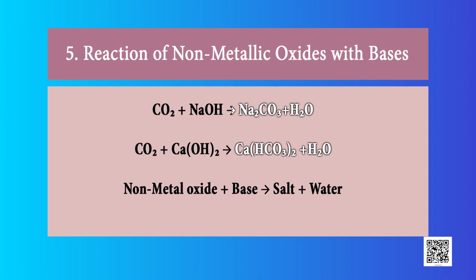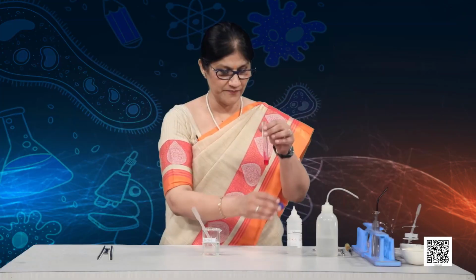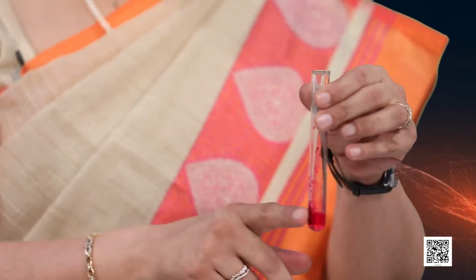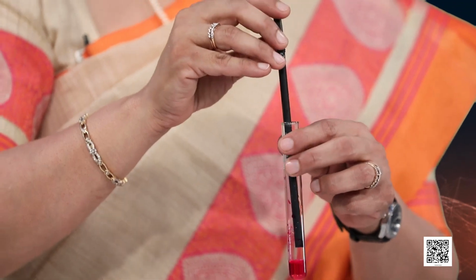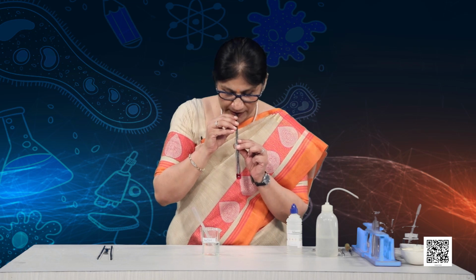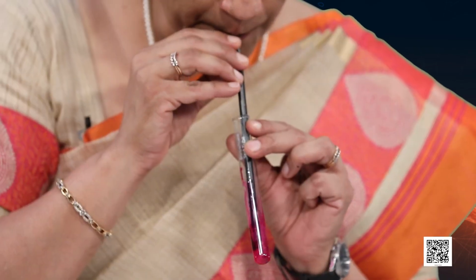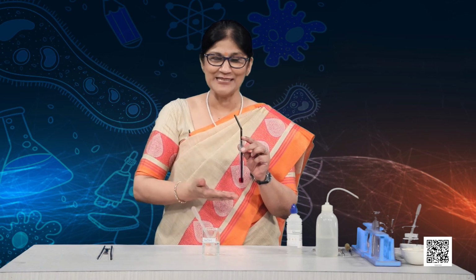So, I have taken a base and an indicator which will tell me whether the reaction has taken place or not. Okay. So, base and phenolphthalein, the indicator, and the non-metallic oxide is the carbon dioxide that I am going to blow into this. And let us see whether something happens, whether color changes or not, you have to see. Okay. So, blowing in carbon dioxide. While blowing in, you have to remember that you do not have to suck it in, otherwise all this material will go in. So, you have to be very careful.